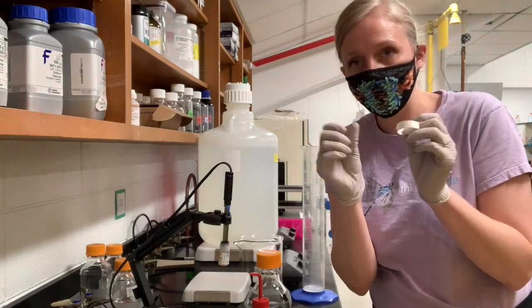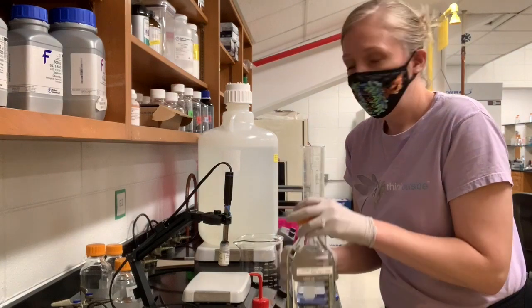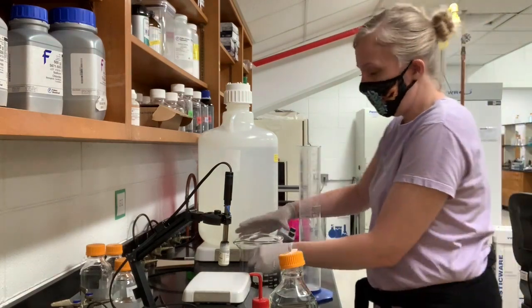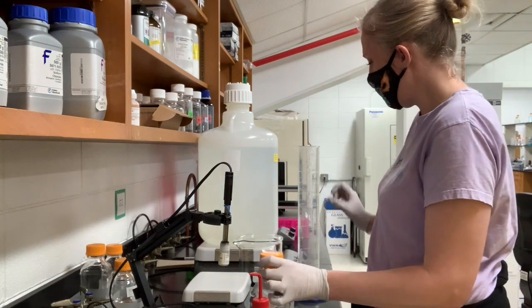I'm going to take my label that I've already made that has my initials and date and what the solution is, and move it to the bottle. So now if you had lots of graduated cylinders going at once, you might even move the tape to the graduated cylinder and then to the bottle. That would probably be the most careful thing to do.